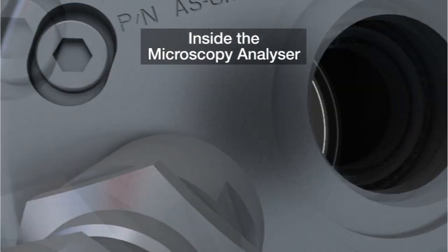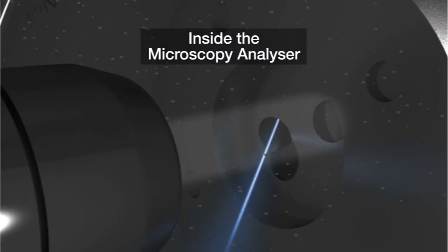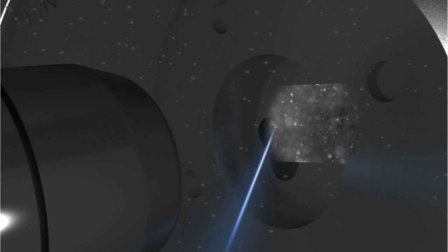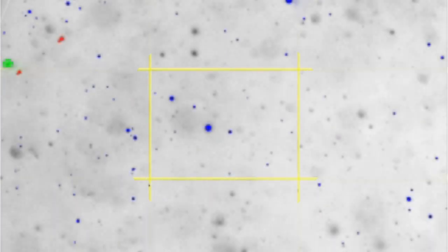As water flows through Advanced Sensors Microscopy Analyzer, images are captured for solids dimensions, oil droplet dimensions, and gas bubble dimensions, while still reporting concentration levels.